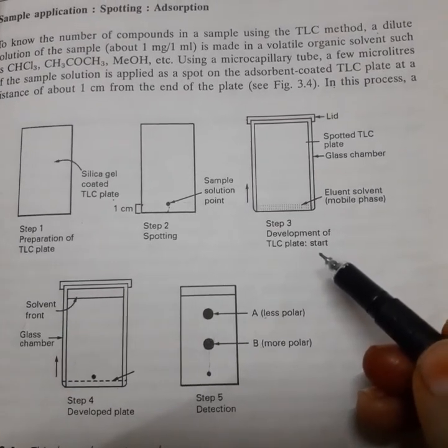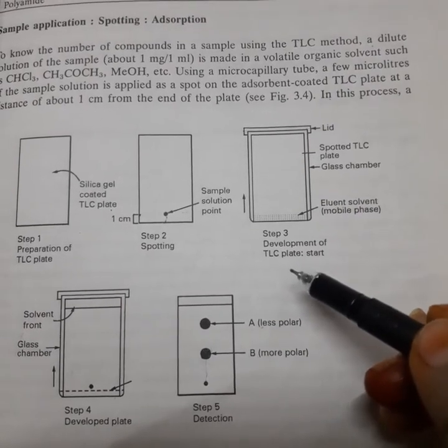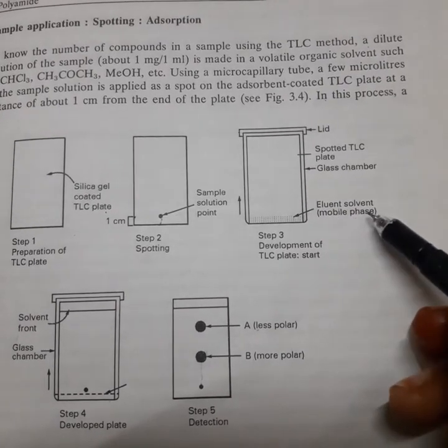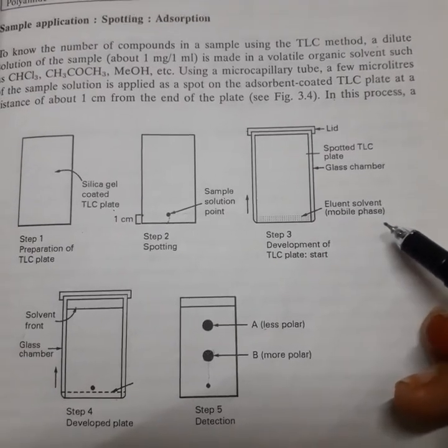Development of the TLC plate. This TLC plate is placed into the TLC chamber. Okay, and the TLC chamber already contains what? Eluent, that is mobile phase.